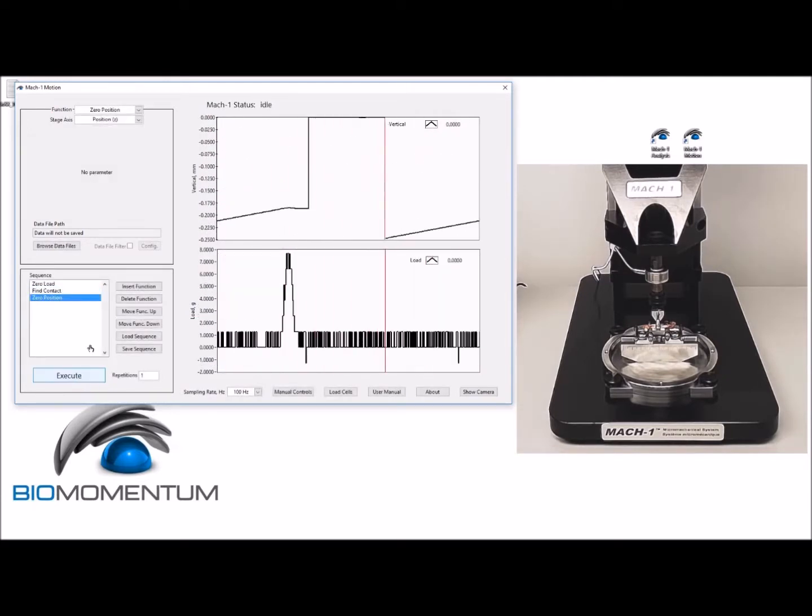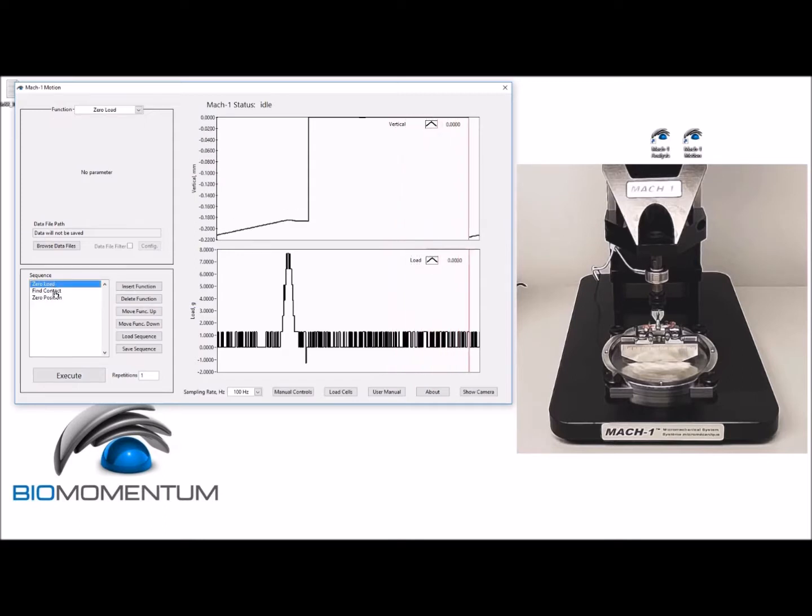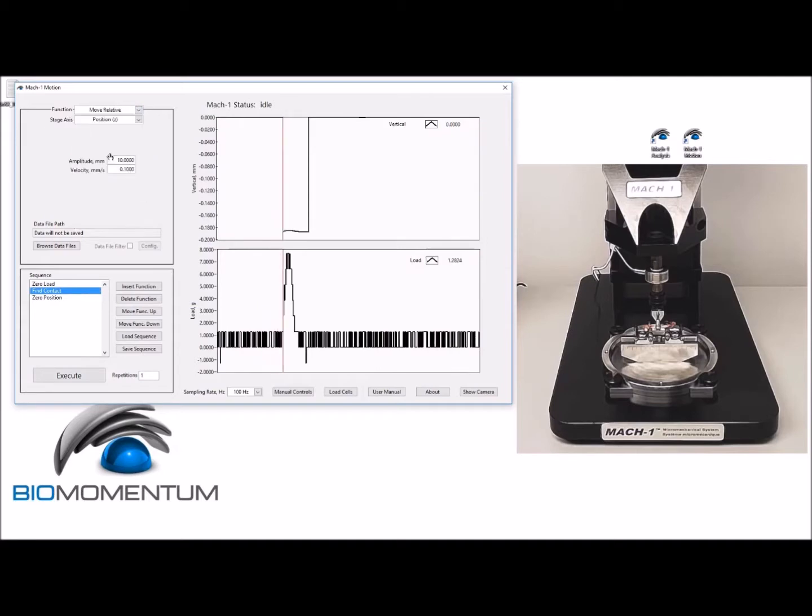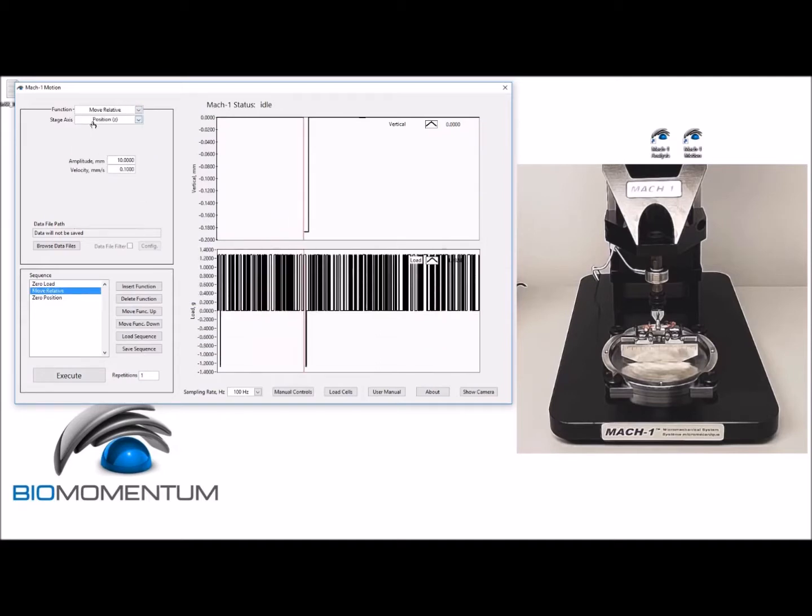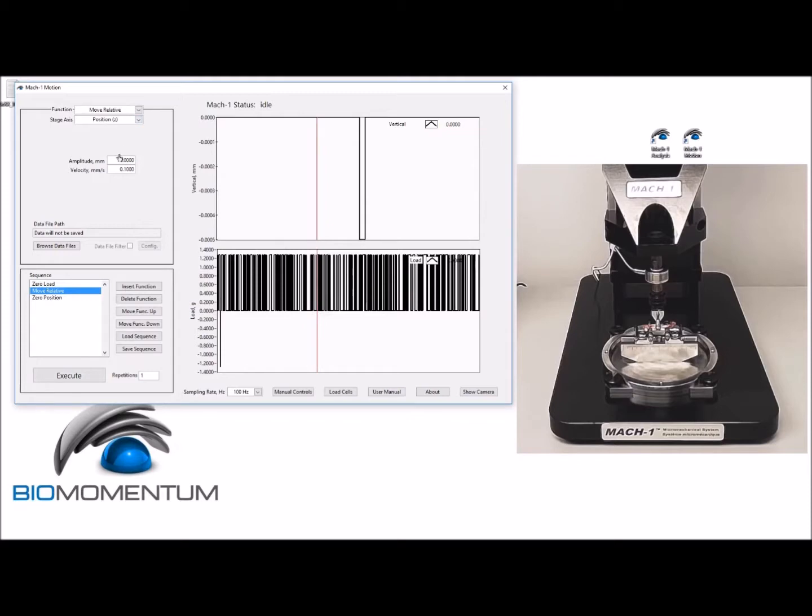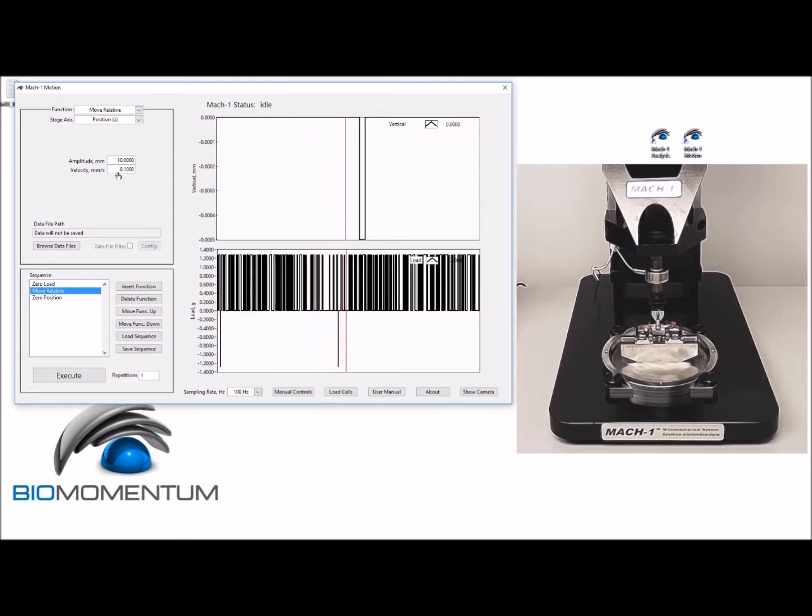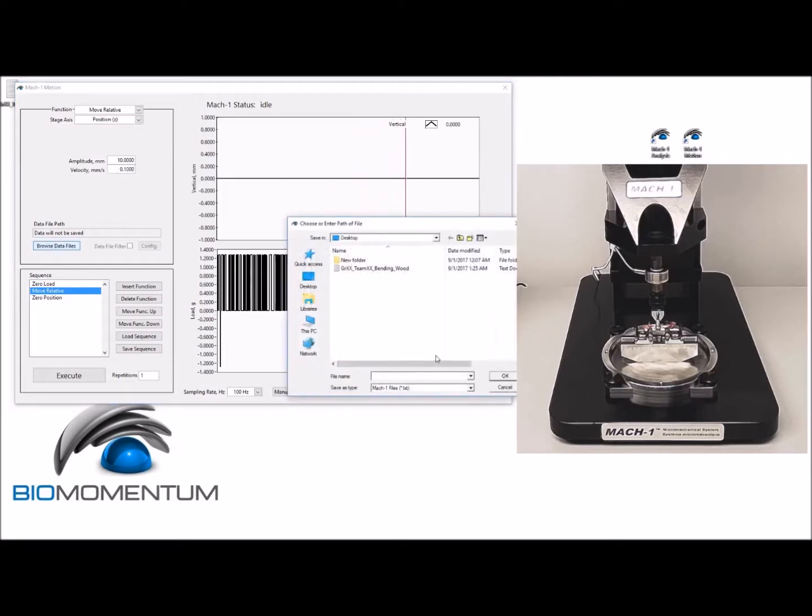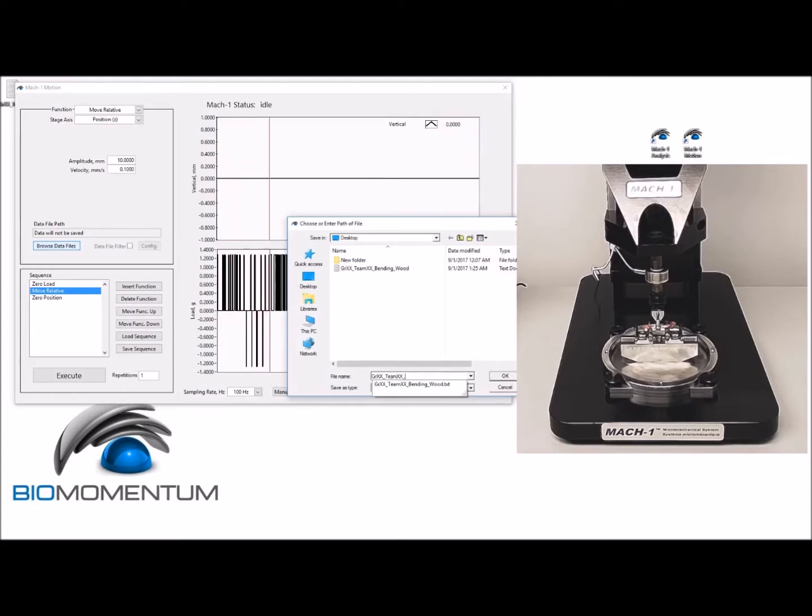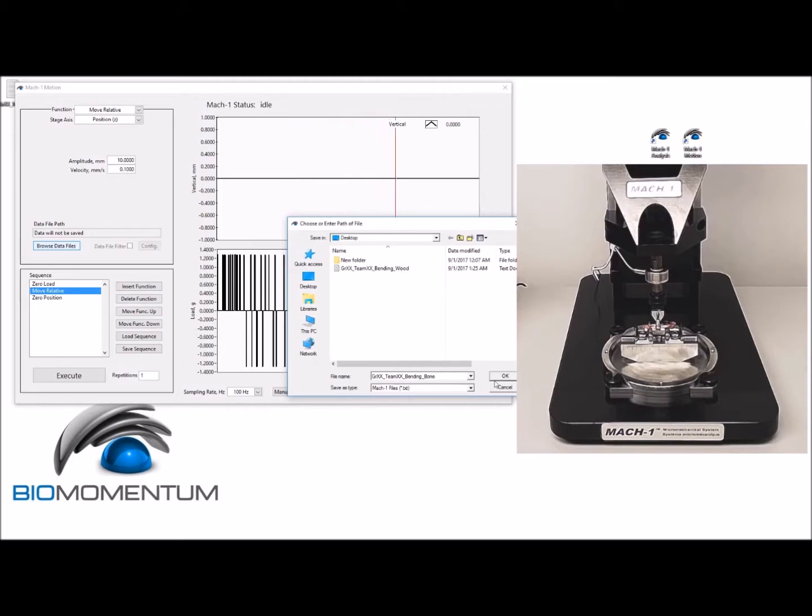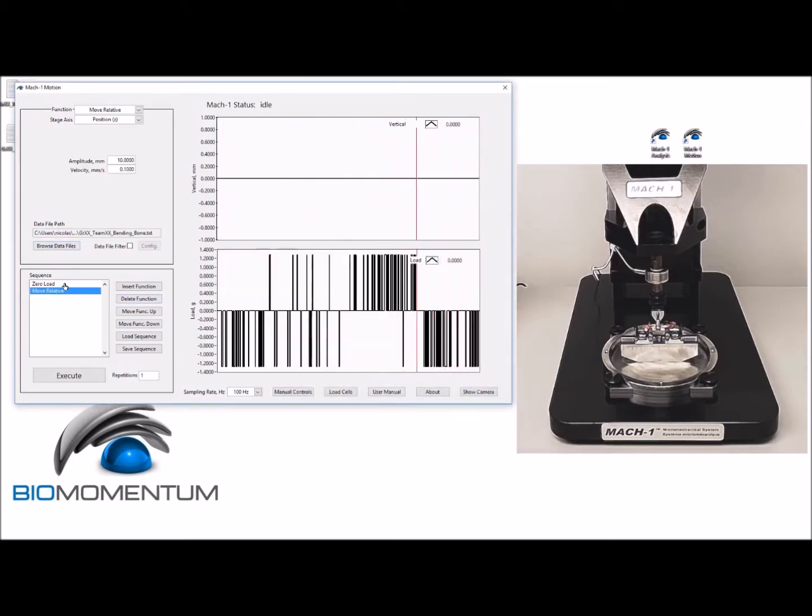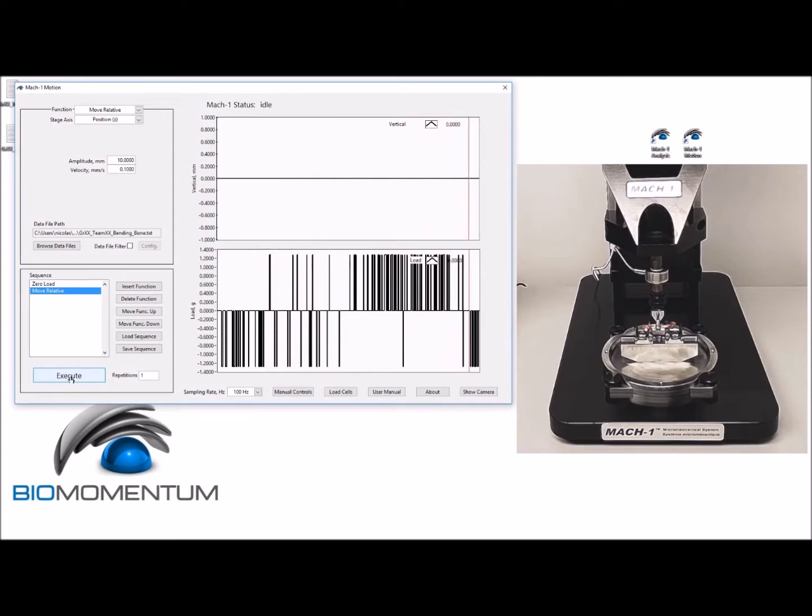Then proceed with the bending test using the following sequence: a zero load followed by a move relative with position Z as the stage axis, with an amplitude of 10 millimeters at a velocity of 0.1 millimeter per second. Save the data as group number_team number_bending_bone. Remove the zero position from the sequence and then execute the test.